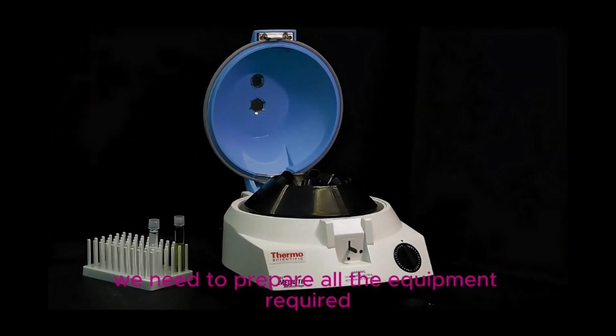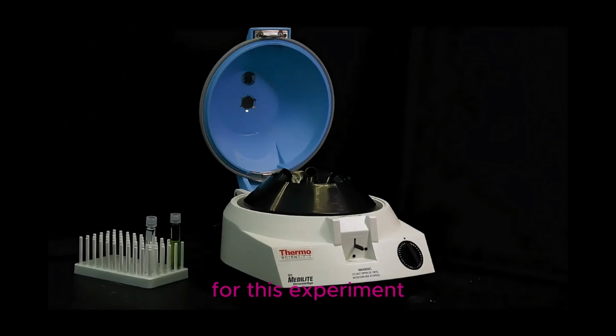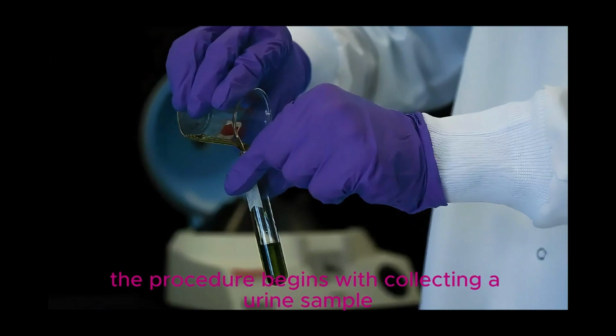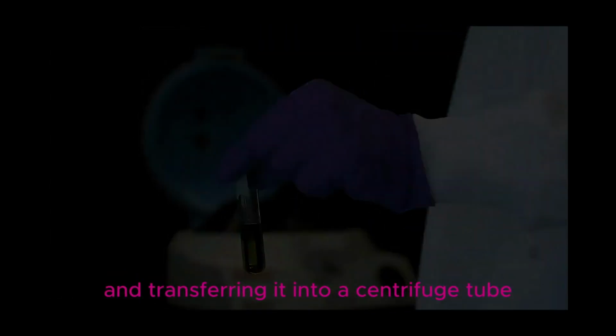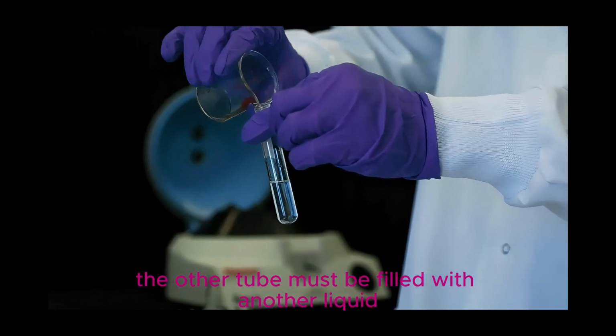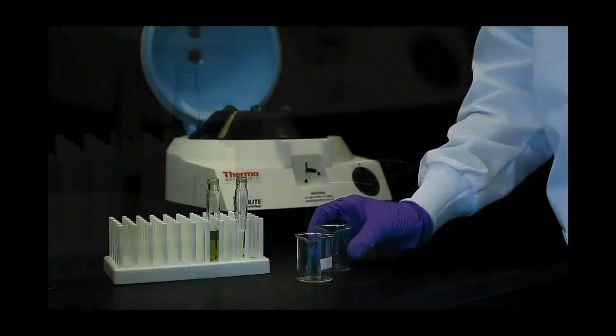First of all, we need to prepare all the equipment required for this experiment. As shown, the procedure begins with collecting a urine sample and transferring it into a centrifuge tube. To ensure balance, the other tube must be filled with another liquid of the same volume as the first tube.